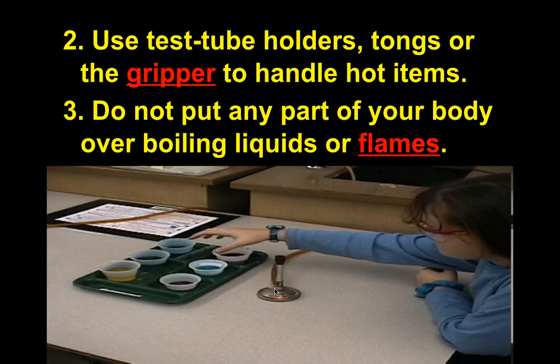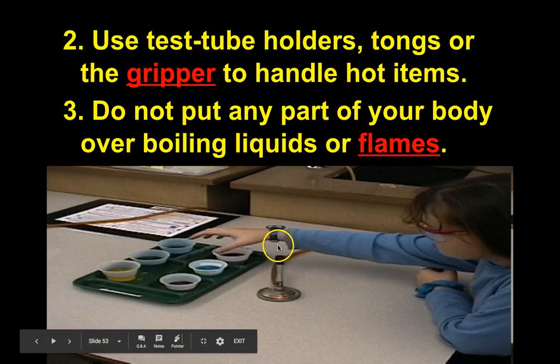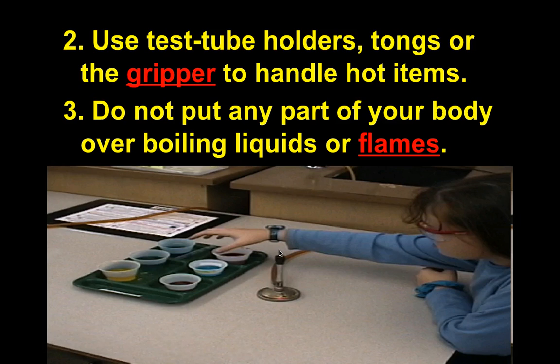Do not put any part of your body over boiling liquids or flames. Be aware that in a well-lit room you might not be able to see a Bunsen burner flame. Always assume there's a flame if a Bunsen burner is set up — don't assume it's off just because you can't see the flame, or you could burn yourself.